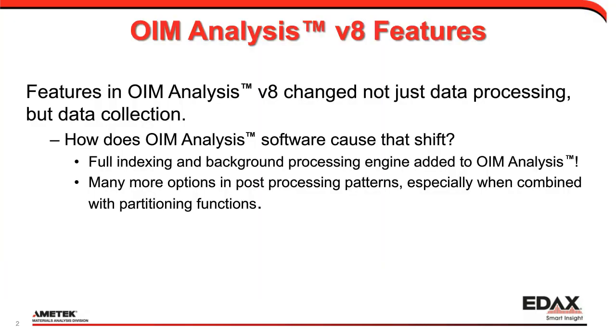So one of the new features in this version is not just the data processing, but we've added a lot of the indexing engine inside of the software itself. This allows us to do a lot more options in post-processing patterns, especially when combining with the partitioning functions. And the partitioning functions are a neat way of pulling apart your data to get to the subsets that you want to play with.